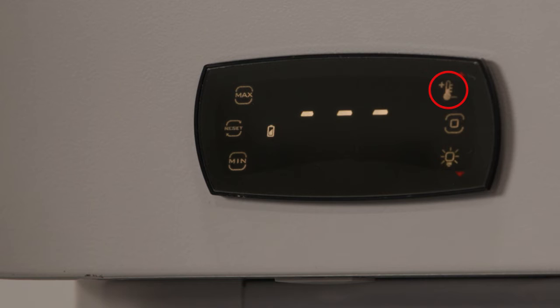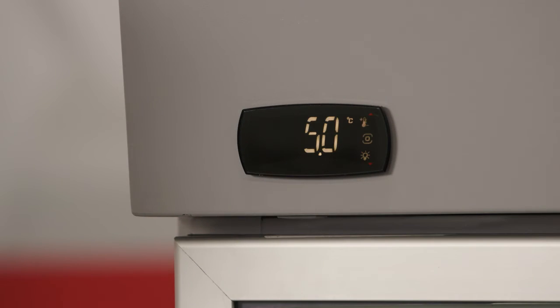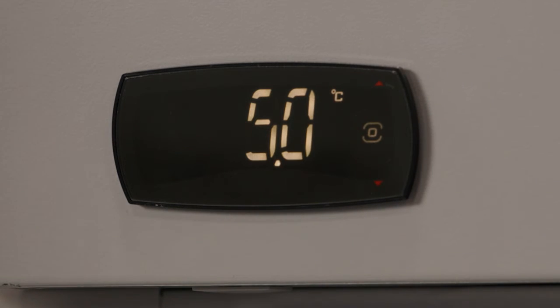Press the set point button in the upper right position to view the current set point. This button also functions as the up arrow when scrolling through menus or changing parameters and settings.